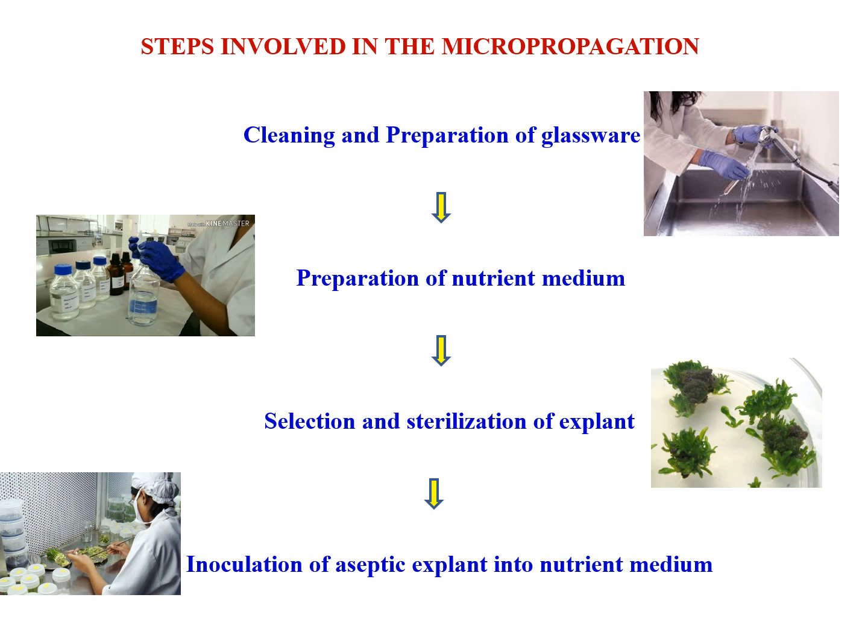After coming to this knowledge, we have framed a certain defined protocol, procedure, or steps involved in the micropropagation technique. First, we have to clean and prepare the glassware for plant tissue culture. The glassware to be used for the plant tissue culture technique, from explant preparation to hardening, includes test tubes, beakers, culture tubes, and so on. It should be cleaned in a very hygienic manner.